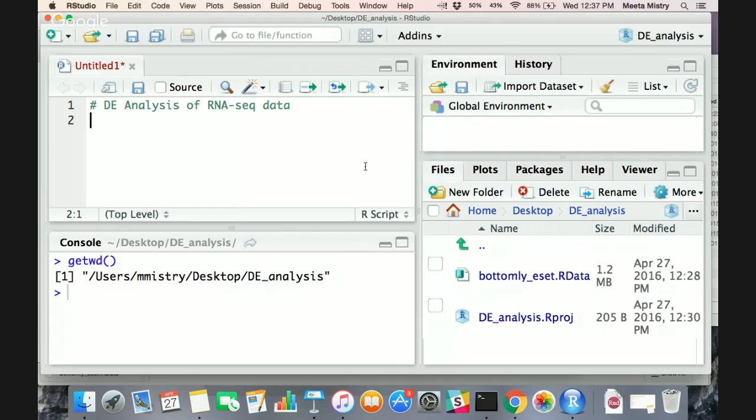Okay, so it's in your uniform document project here. You first need to move that download there, wherever it is. Probably easiest just to cut and paste it. That's why this space is not working: it's looking for the data in this folder, and it's not in there. Since you have the project working, if you move the data in there, it should be good.